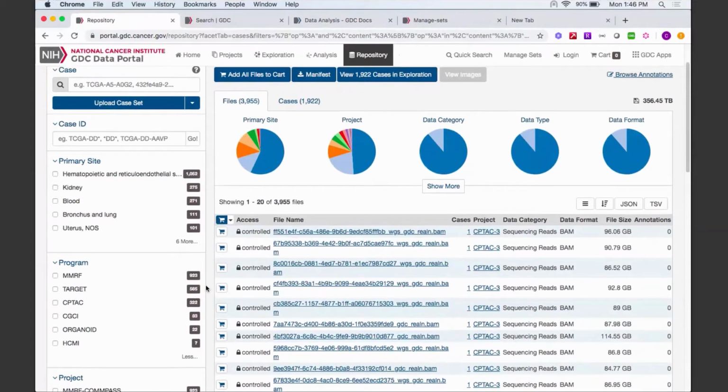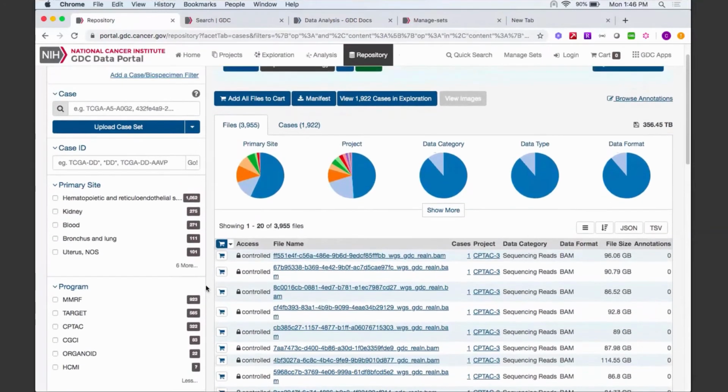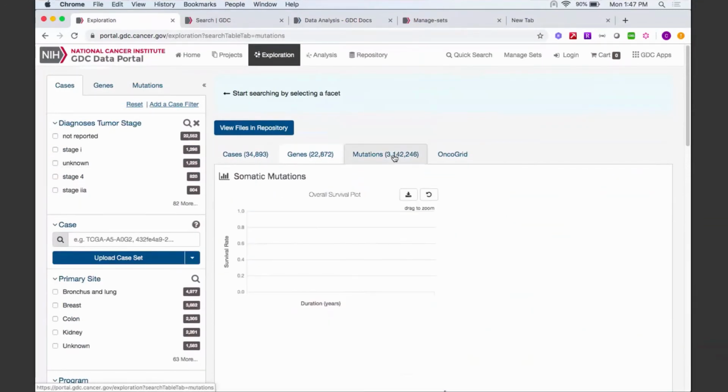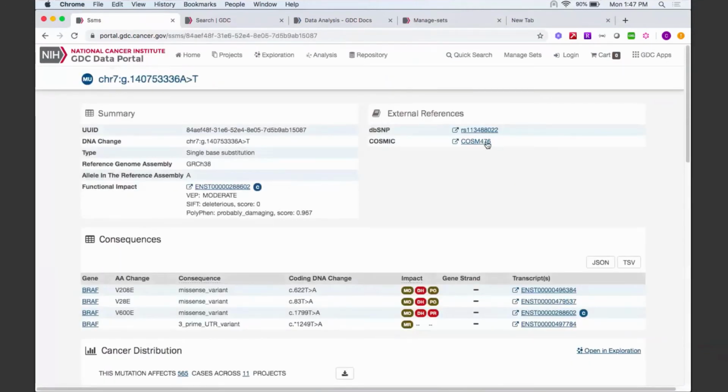Michael, I have some more questions. Are variant annotations from ClinVar, OncoKB, CIViC integrated in GDC? If not, are there any plans on integrating such annotations? There are various annotations that are available. I don't know if you can click on a gene and show what is there. We are actually releasing CIViC annotations next release, but right now we don't have ClinVar. Here's what's being added for our mutation annotations at the moment.